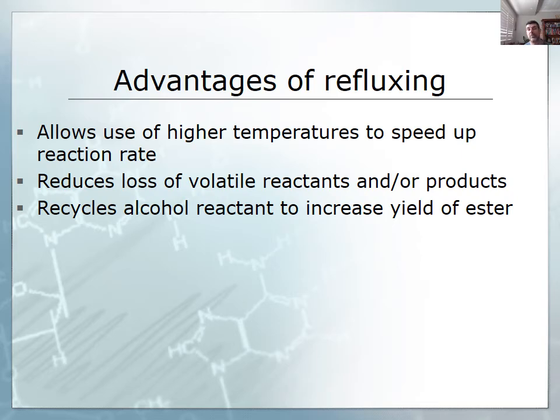So one of the things that you may have to write about are the advantages of refluxing, or why we use refluxing as a technique. There are a couple of very important ones. The first one is the use of higher temperature, and of course higher temperatures mean an increase in the kinetic energy of the particles, and this means there are more of them that will average out at sufficient activation energy in order for the reaction to proceed.